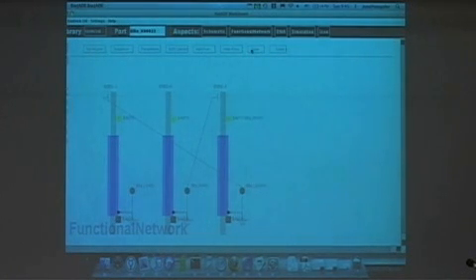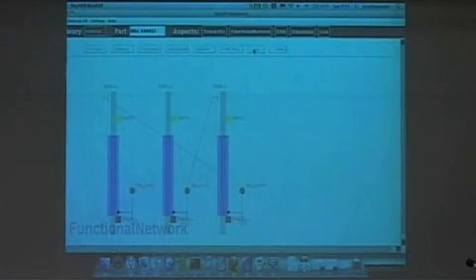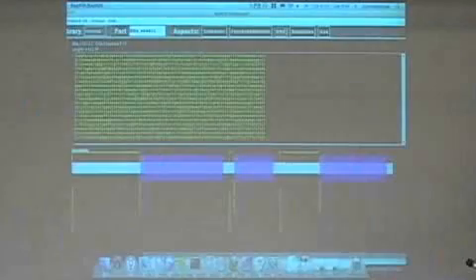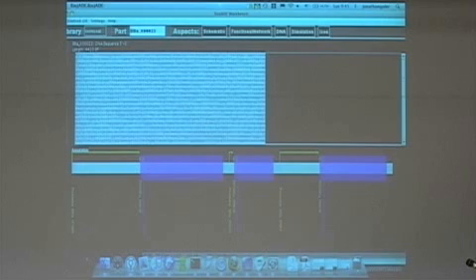And when you save it, it's supposed to generate the DNA. There's something not quite right about it. There we go. And this generates a DNA layout, so it shows where the various features that you've designed are on the sequence, and it shows you the entire sequence of the part that you've designed.